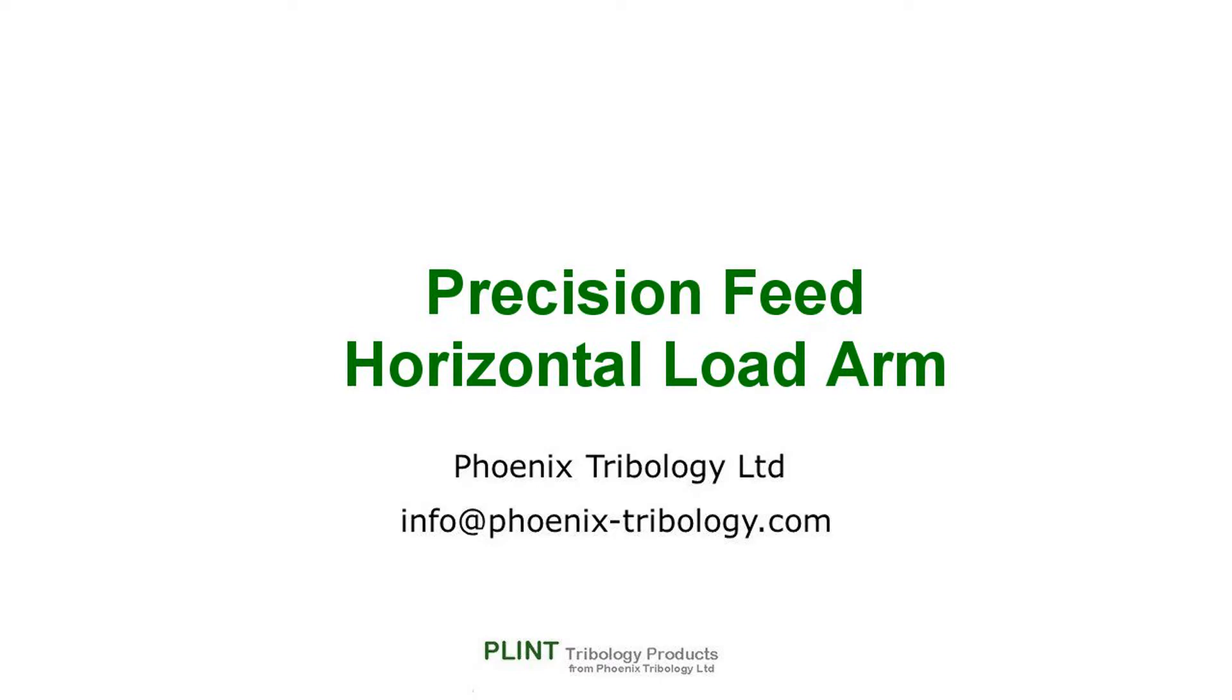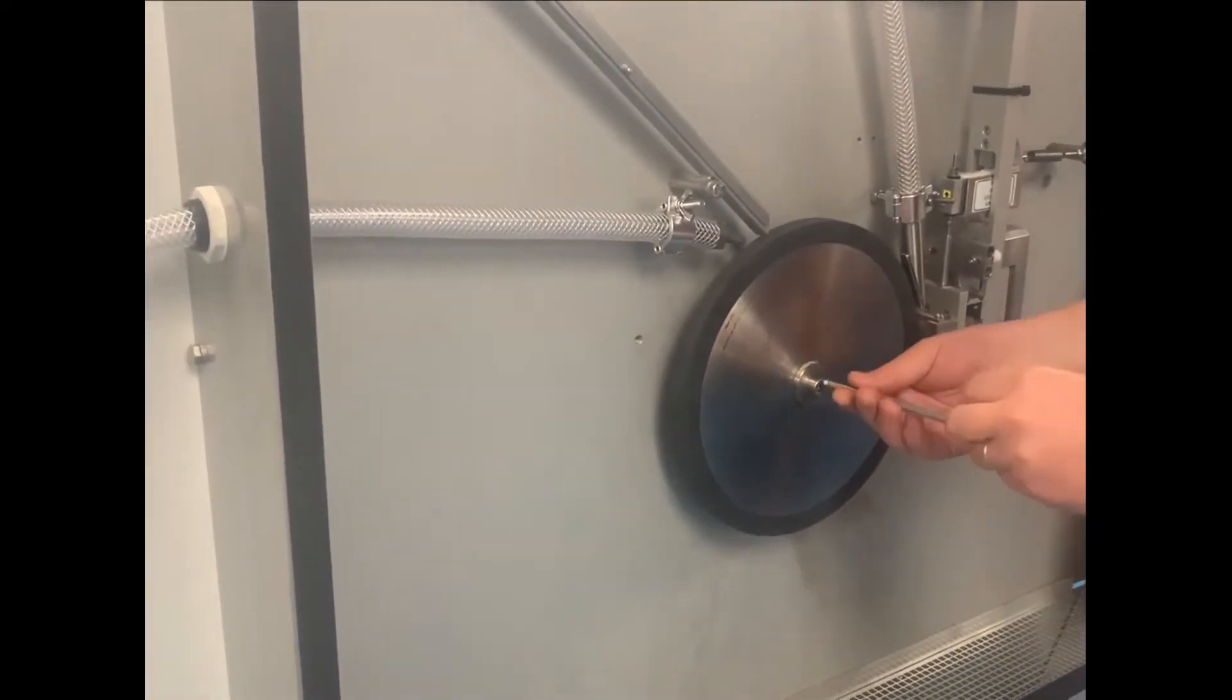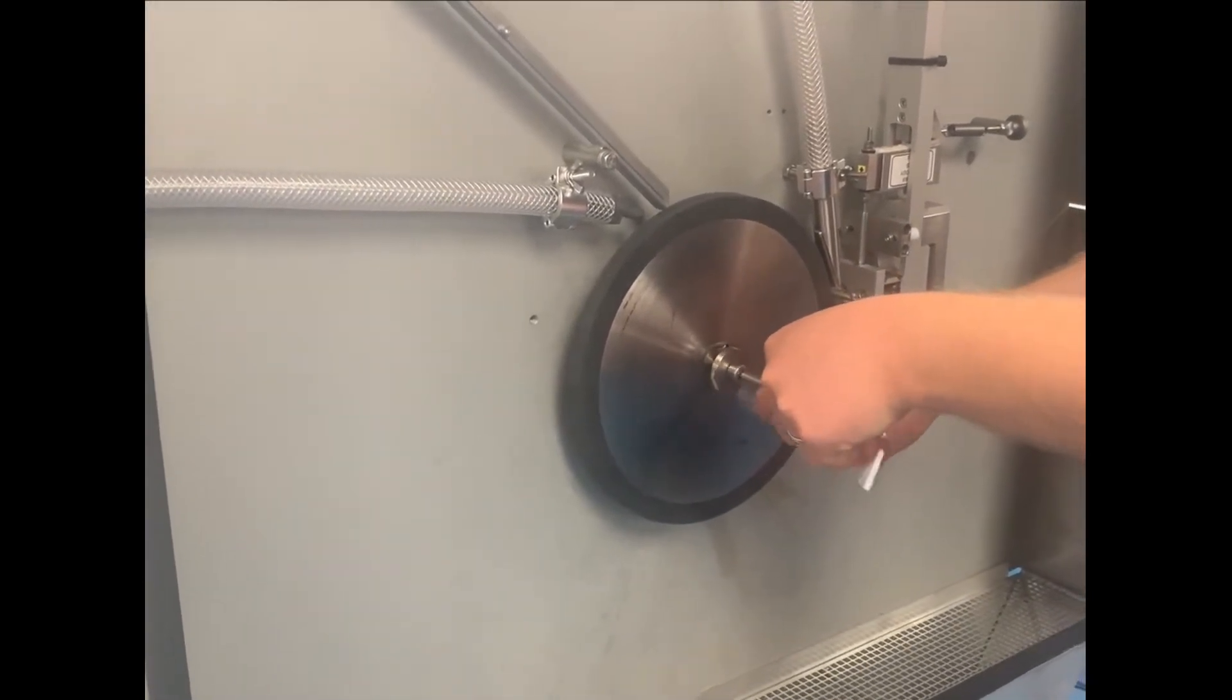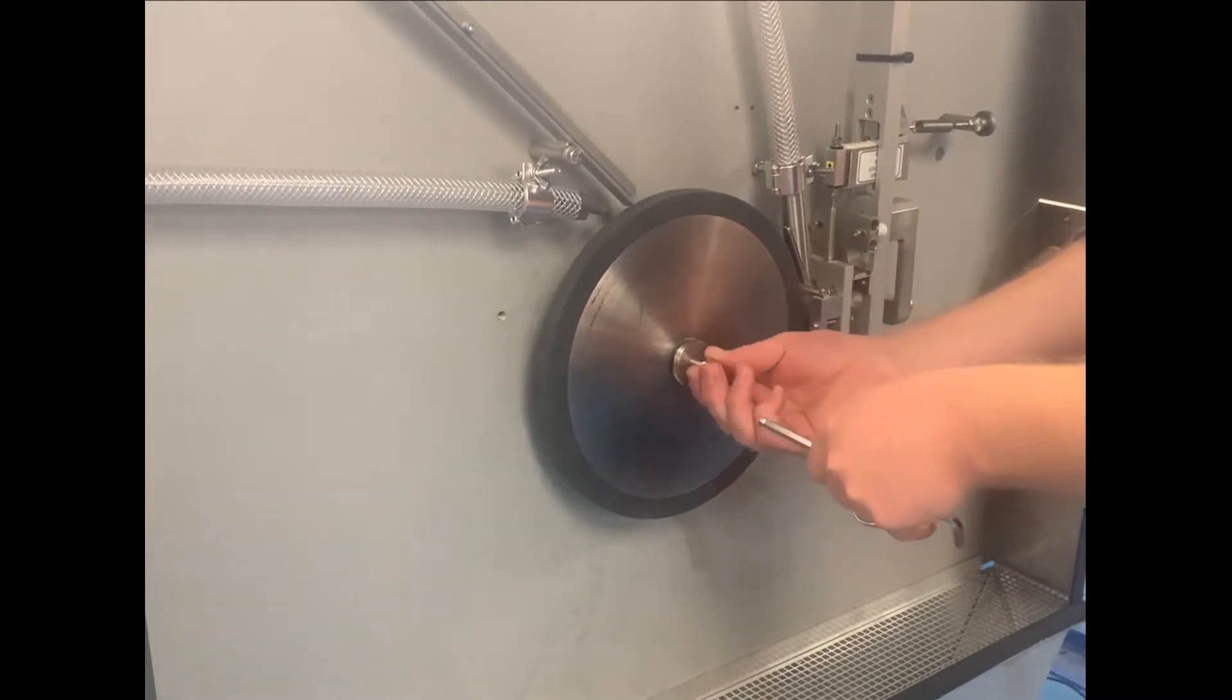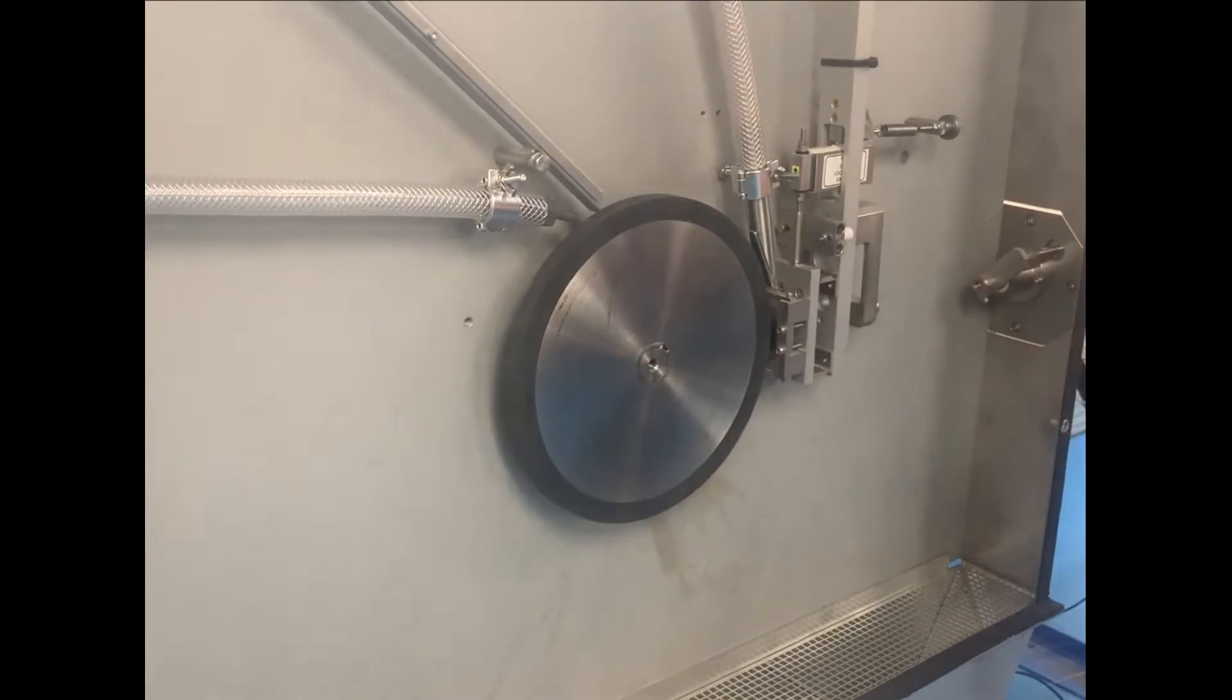To convert to precision horizontal feed, start by removing the test wheel.